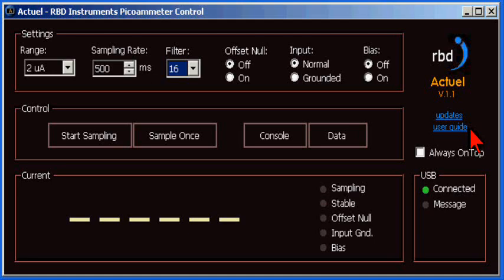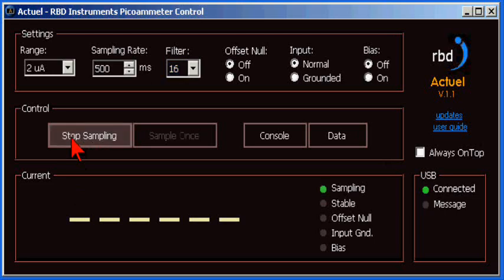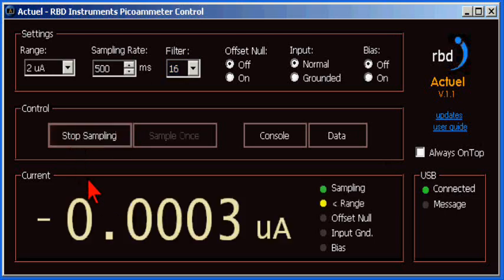So, let's take a measurement. To do that, just press the Start Sampling button. Now, I will turn on my current source and set it to 1 microamp.